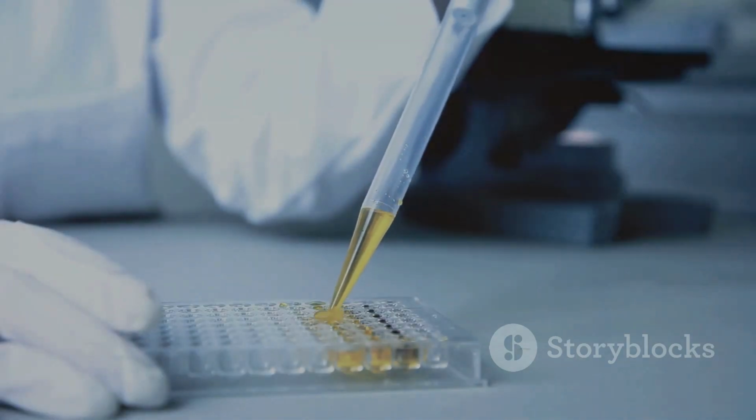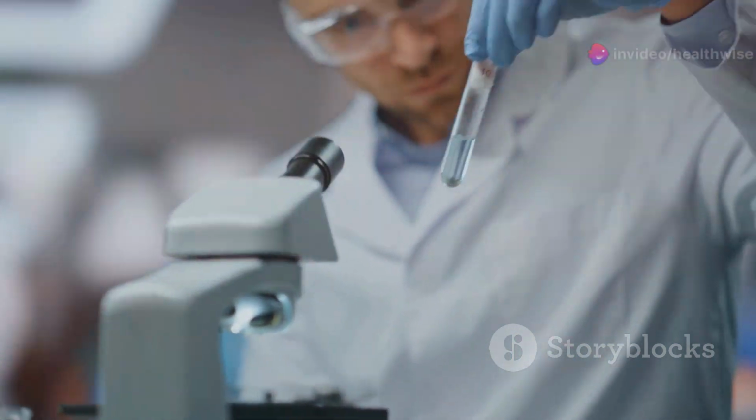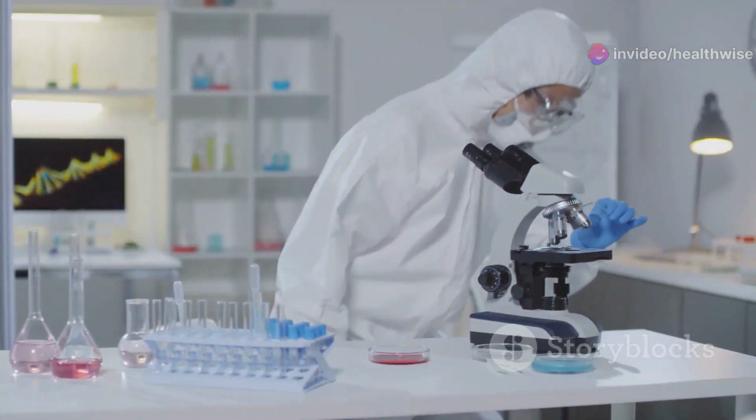Speaking of calibration curves, you'll need one for the Biuret method. Prepare a series of tubes with known protein concentrations and treat each as a test. Plot absorbance against concentration on a graph to create your calibration curve.